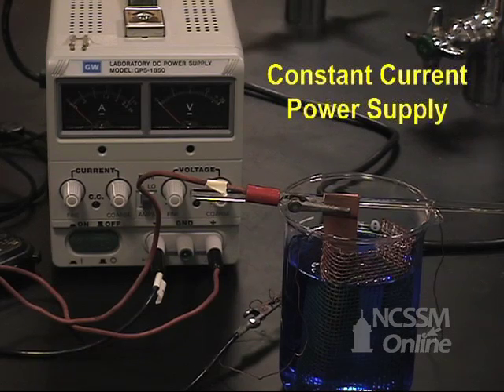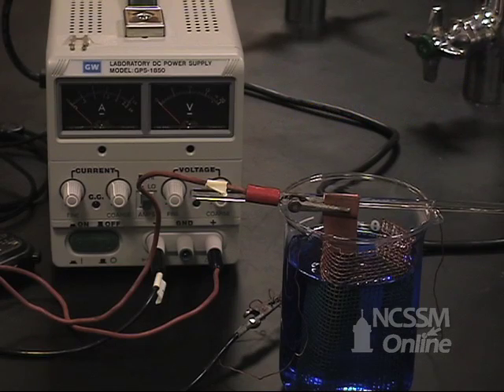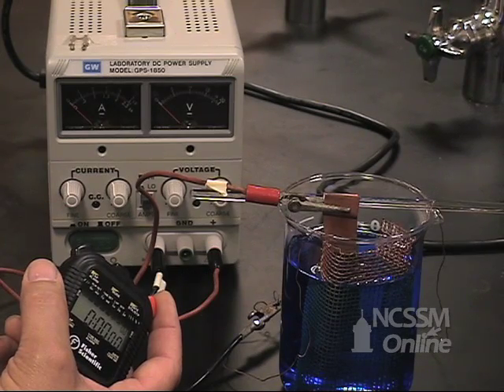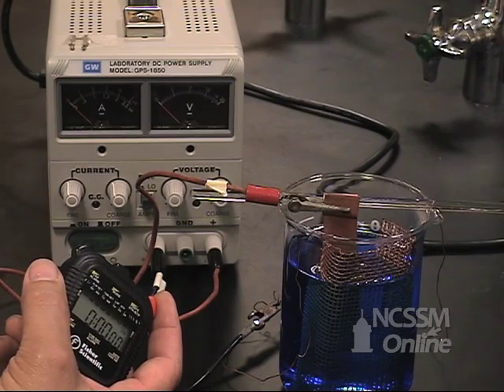Our power supply is a constant current power supply. We'll adjust the voltage, and it will provide a constant current over the period of time that we're doing the electrolysis. The power supply will provide a constant current, and we'll read that current from the meter.